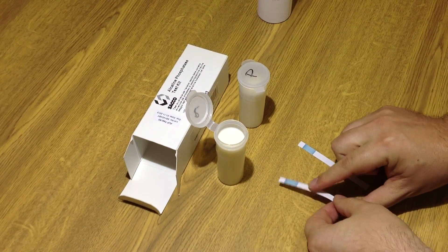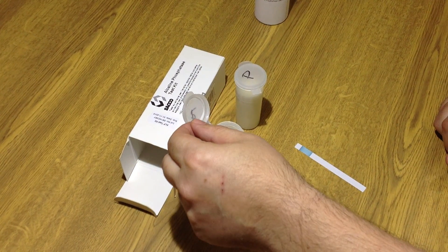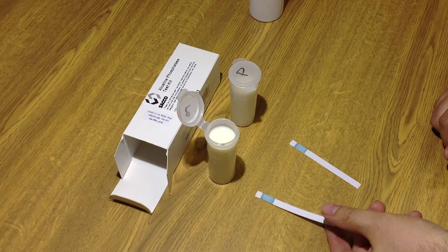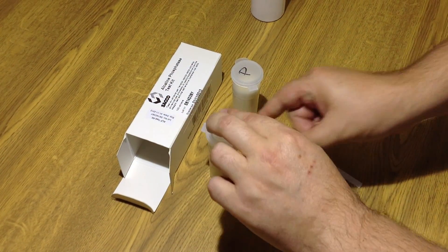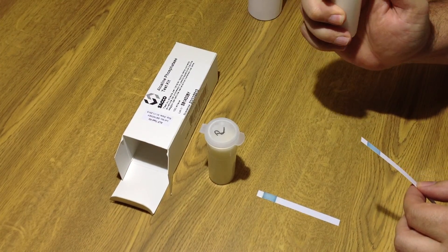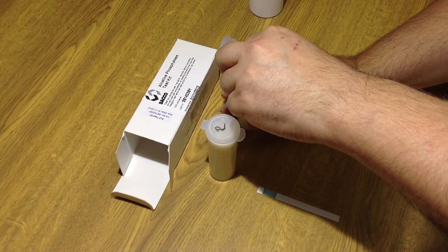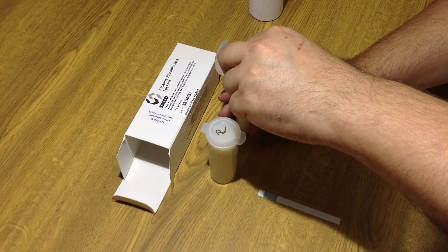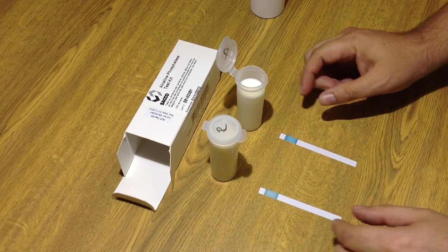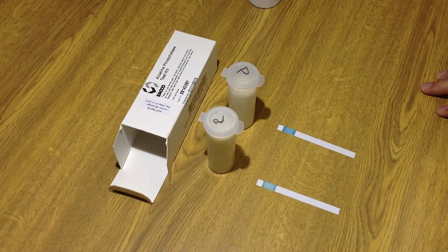We're going to dip the test strip into the raw milk sample for two or three seconds. I'll do the same with the pasteurized milk. And without any incubation, we're going to wait five minutes.